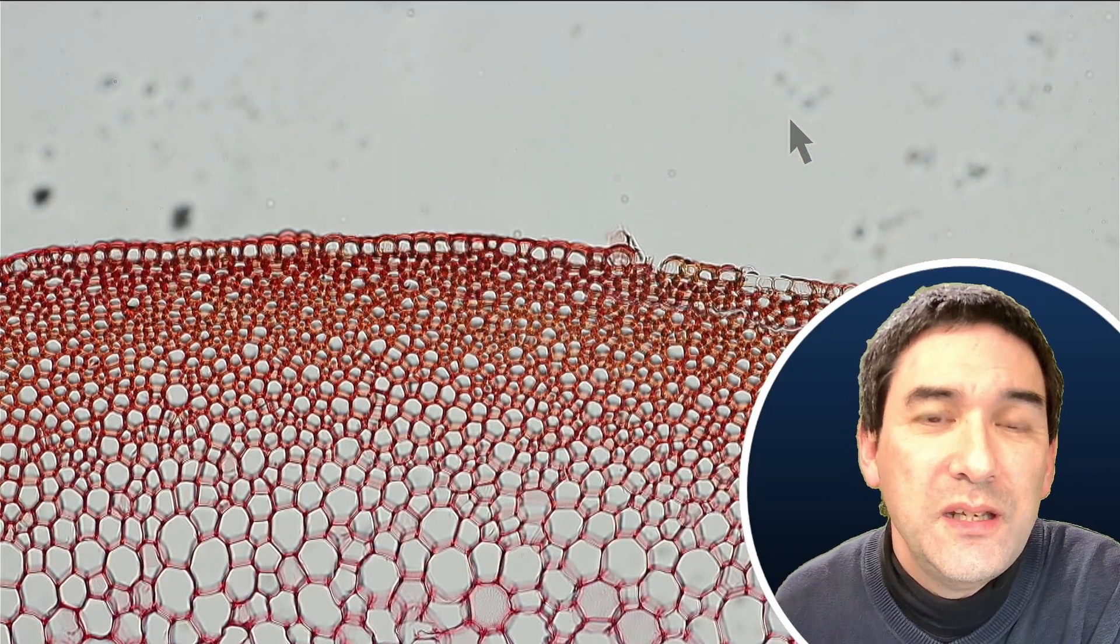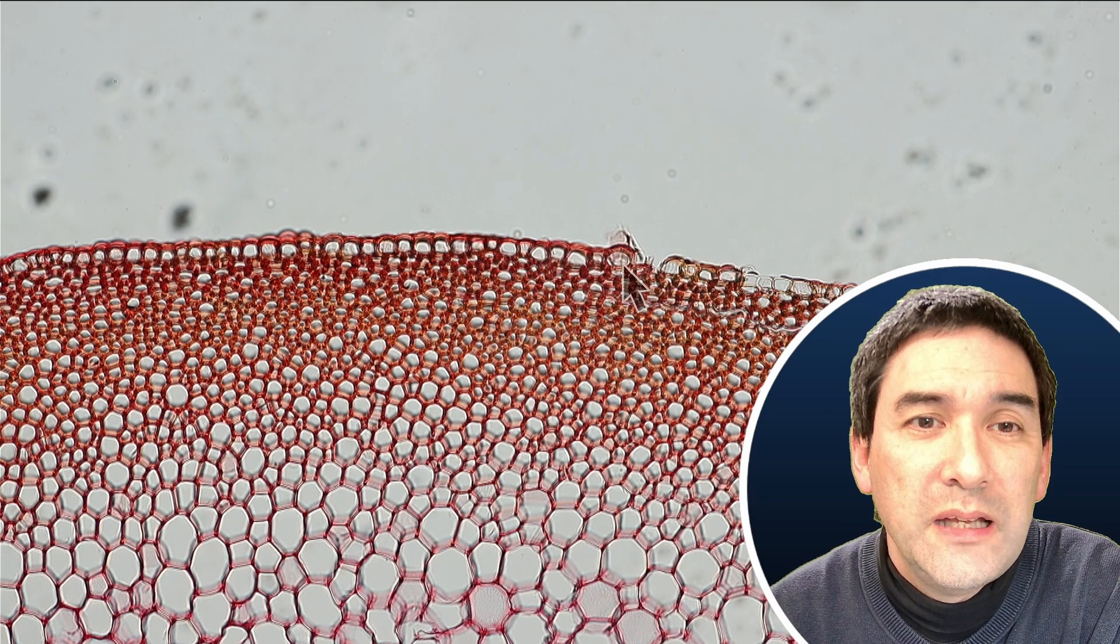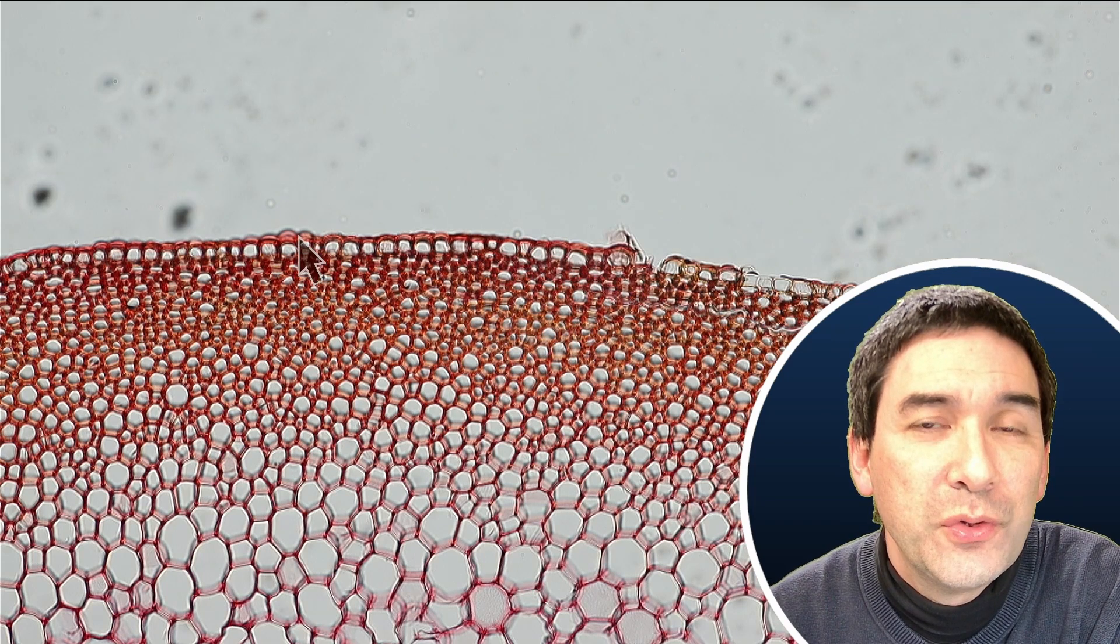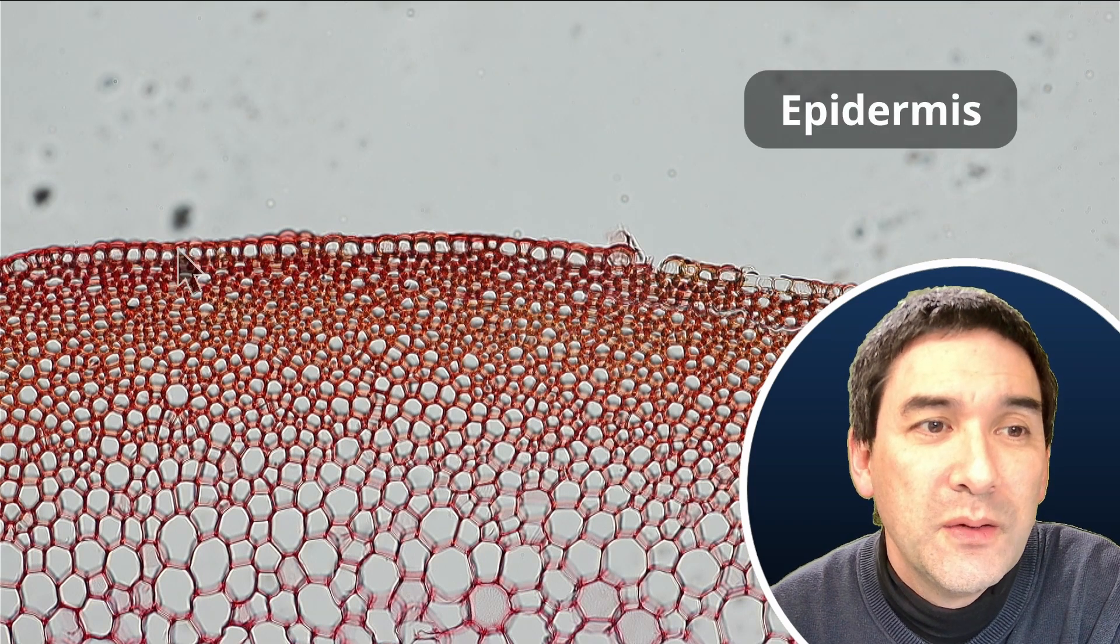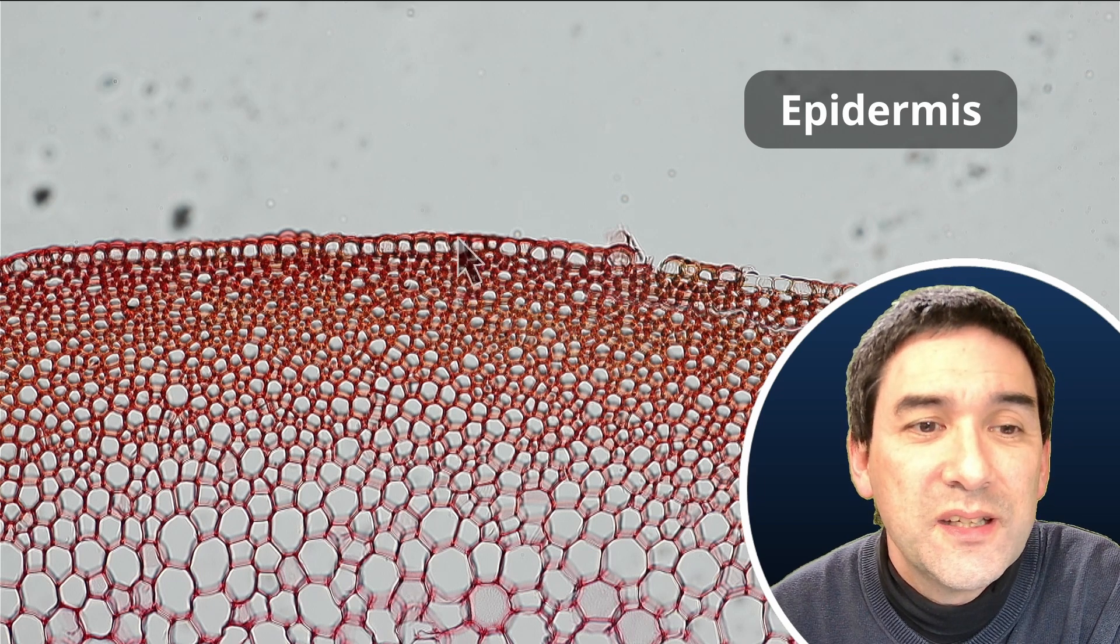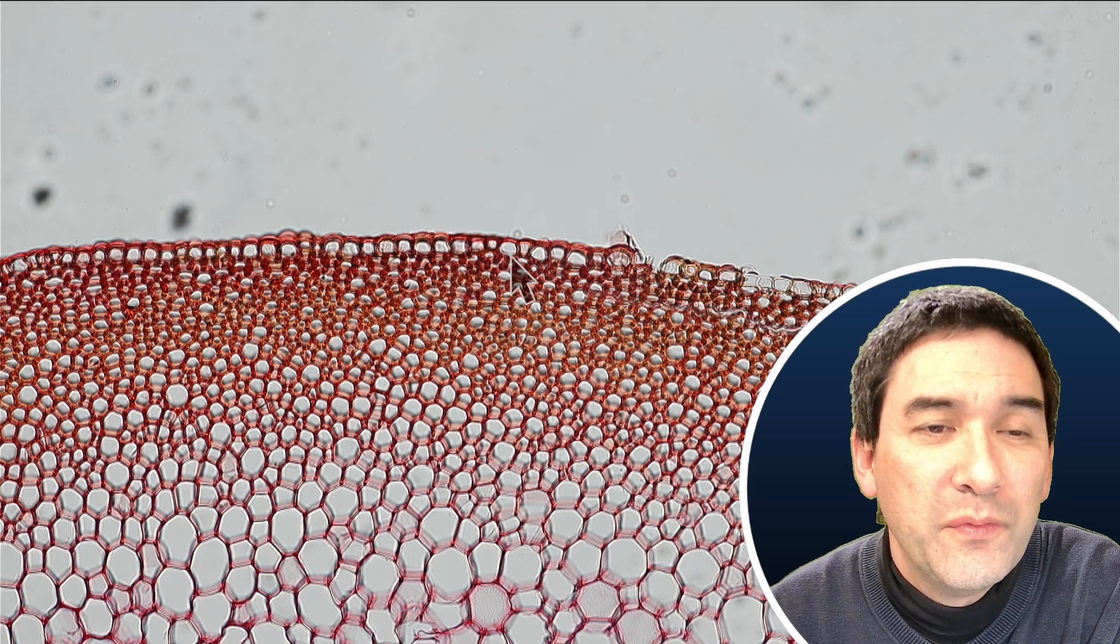Now when we look a little bit on the outside here, then we can see that this is also a layer of cells here on the outside. That is also referred to as the epidermis, which is the thin layer of cells that is on the outside of the stem.